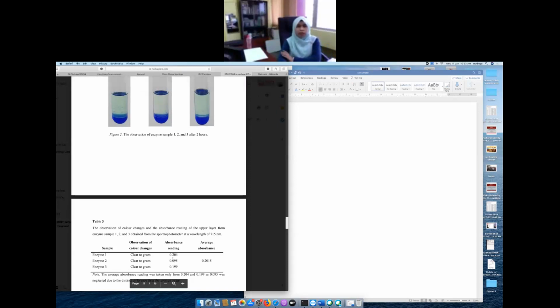Okay, you can see here that tube number 2 is obviously an outlier. It's totally out from this string of readings. That's why we suggest to just remove tube number 2.